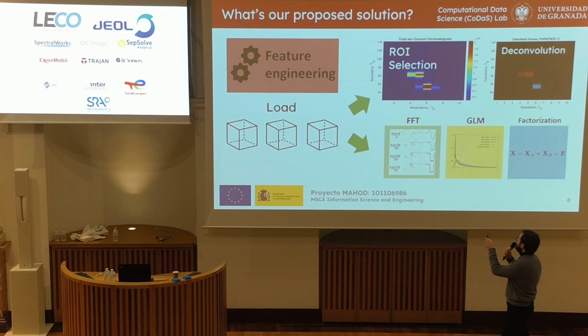So again, I'm going to be doing time domain deconvolution, and then I'm going to be doing frequency domain analysis, and then this multivariate statistical analysis called the GLM. It's a generalization of ANOVA. And we're going to look at the factor matrices and see what we see.